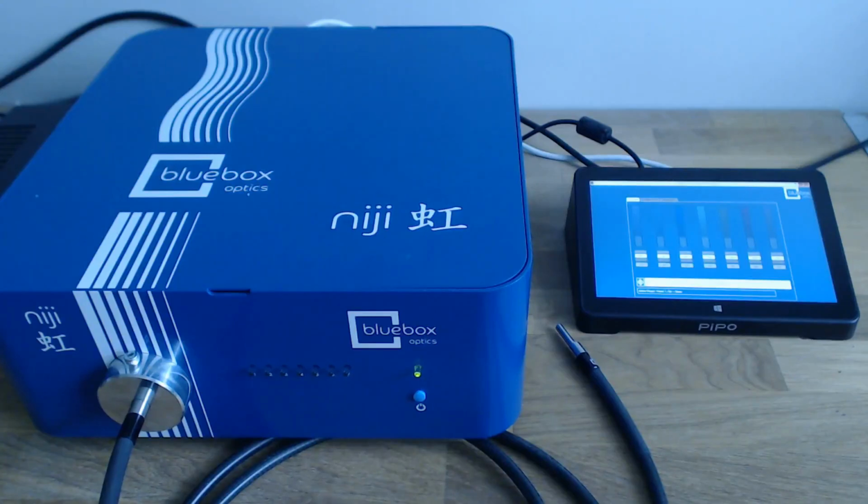Here on the left we have the niji itself, and on the right a little touchscreen PC which runs the supplied niji control software. The niji has one USB and one serial port at the back, so the touchscreen PC is connected to the niji via a serial to USB cable, while the main PC running Micromanager is directly connected to the niji via a USB cable. And commands sent from one device, for example channel states or intensity changes, are instantly reflected on the other device. The touchscreen PC could easily sit next to a microscope.